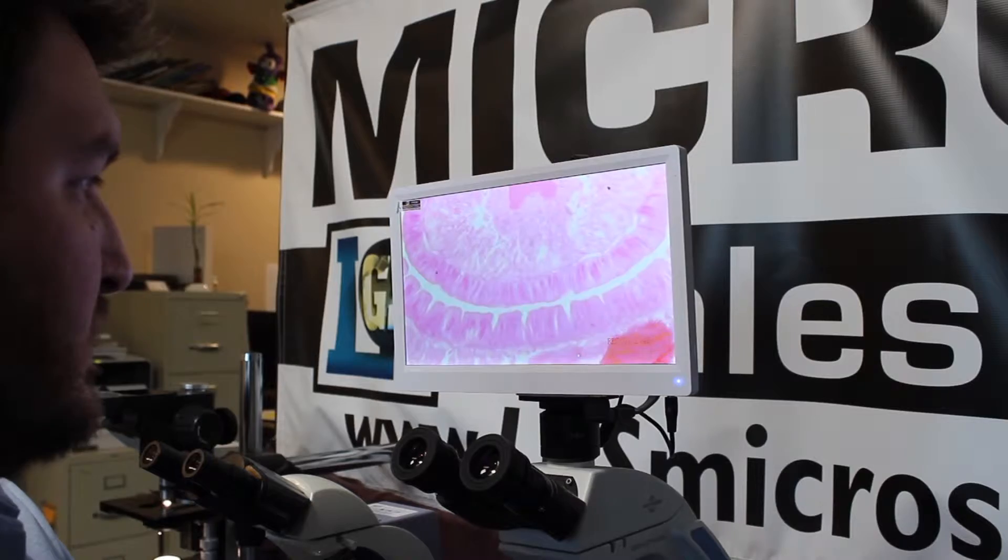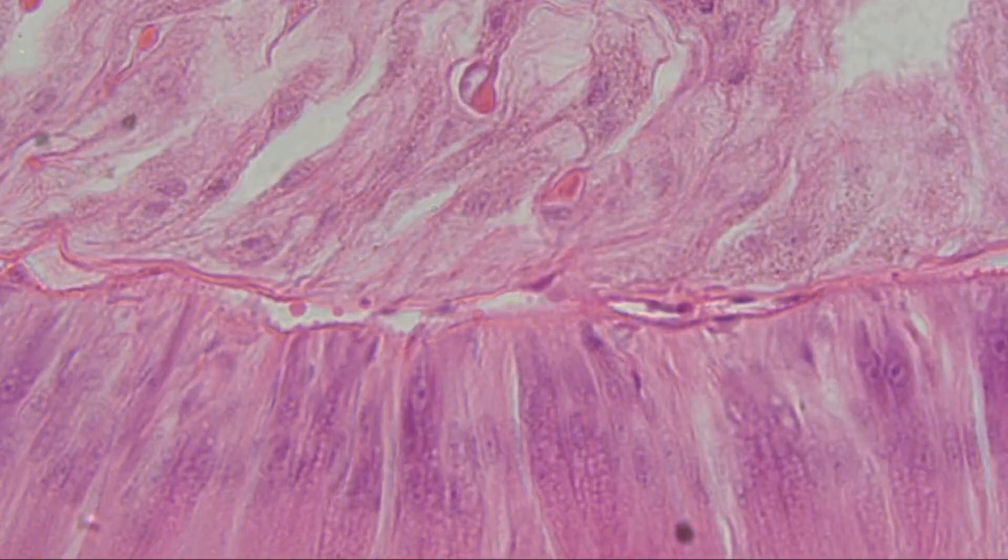So for our comparison we're just going to look at this slide of an earthworm cross-section. For this example we're just going to use 40x magnification.